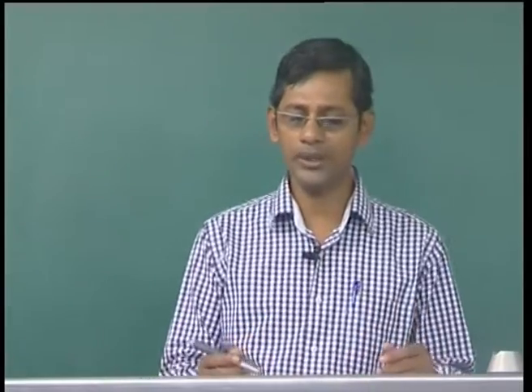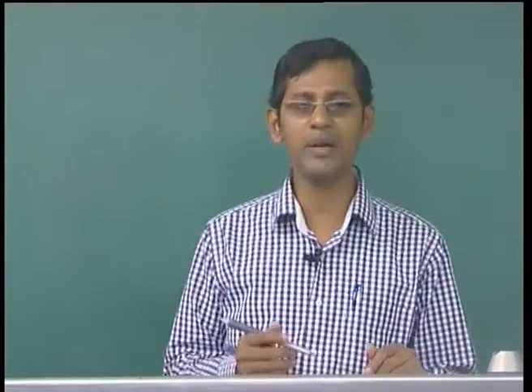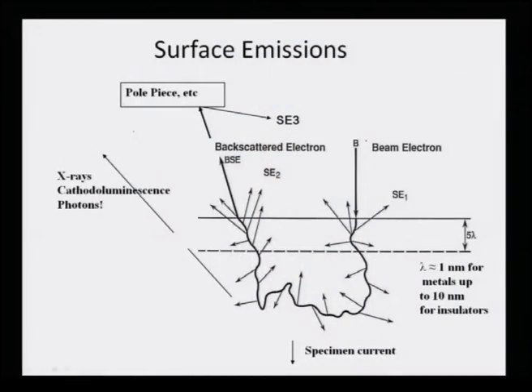So this is again shown here, how the backscatter electron comes into the picture, because backscatter electron is very important for the EBSD study. As the electron falls, it goes into the sample and generates secondary electrons, but it can also get scattered and come out. Many times people say a backscatter electron is one which has fallen on the sample and gets scattered back.